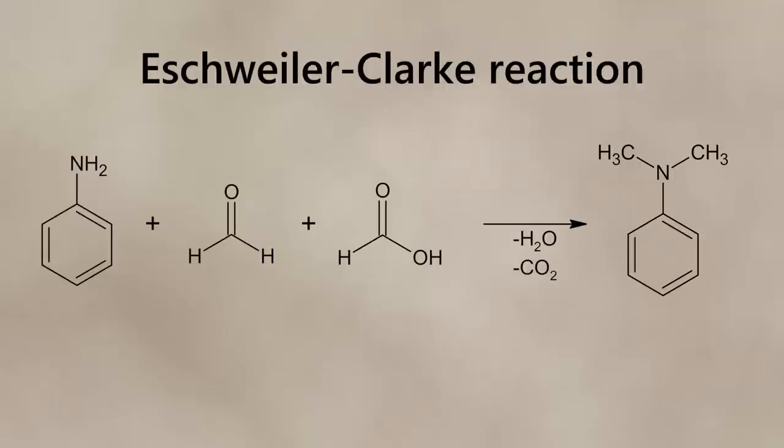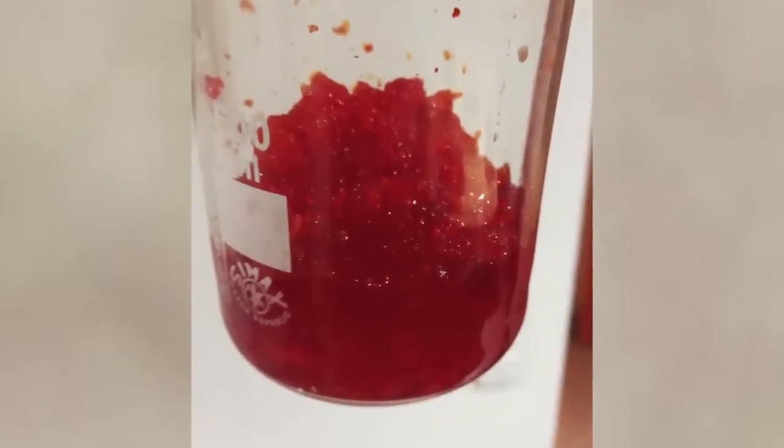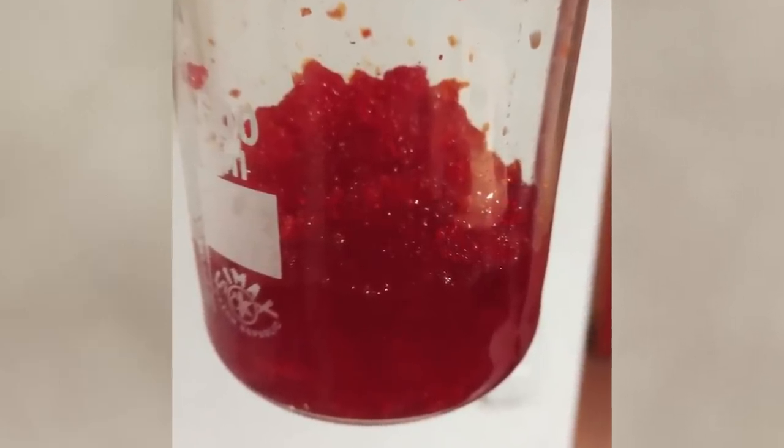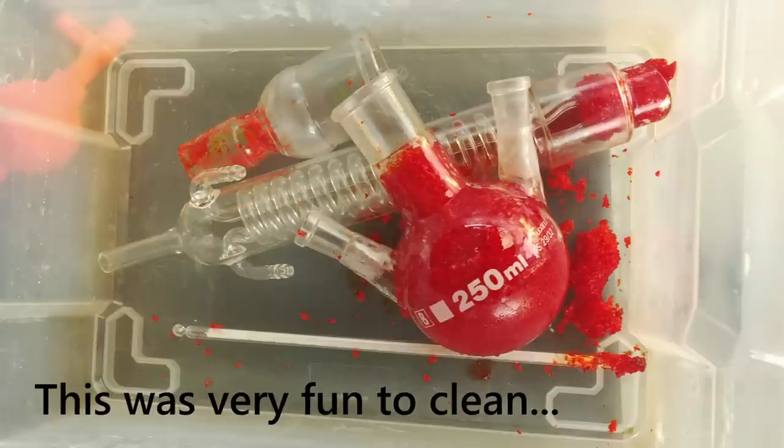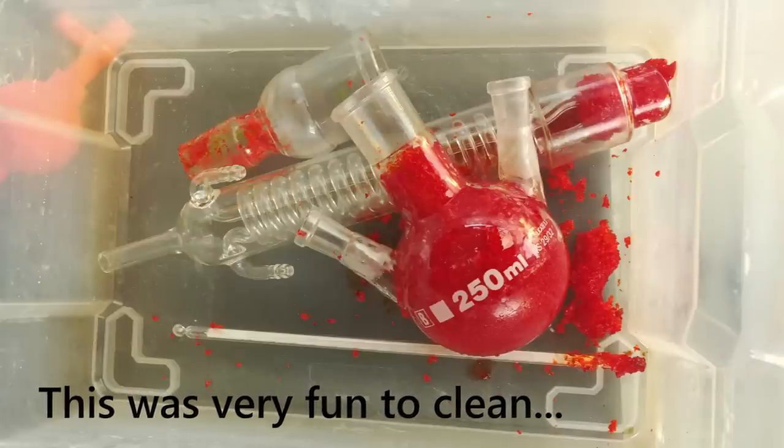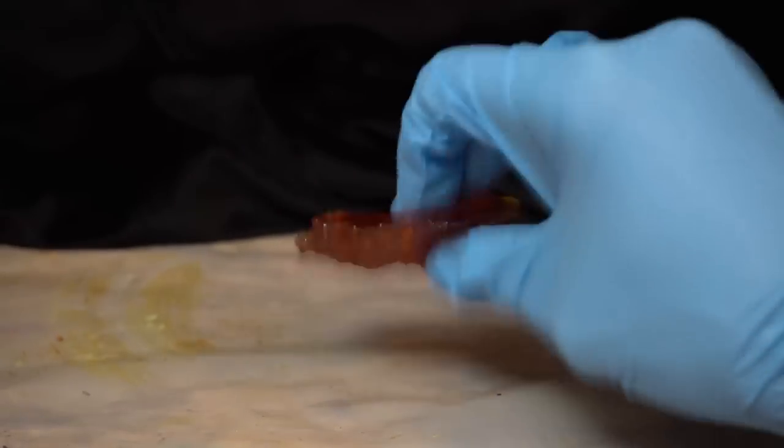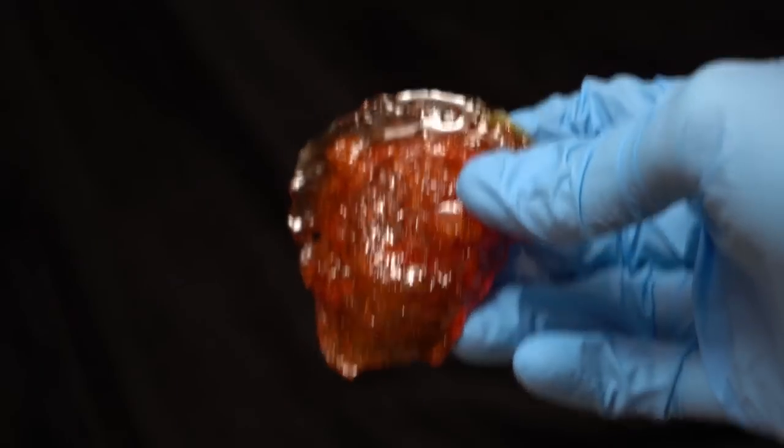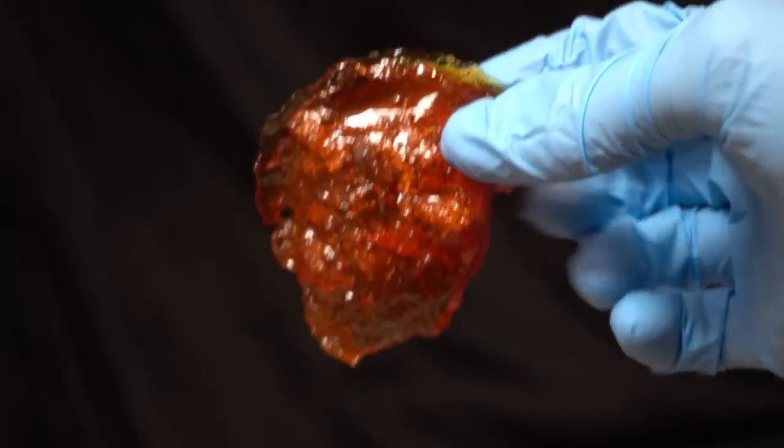My first attempt was an Eschweiler-Clarke reaction on aniline, which is a form of reductive methylation using formaldehyde and formic acid as the reducing agent. Unfortunately the reaction immediately polymerized into a soft jello-like substance, and upon drying it solidified into this plastic block. This is pretty cool but not what I wanted.